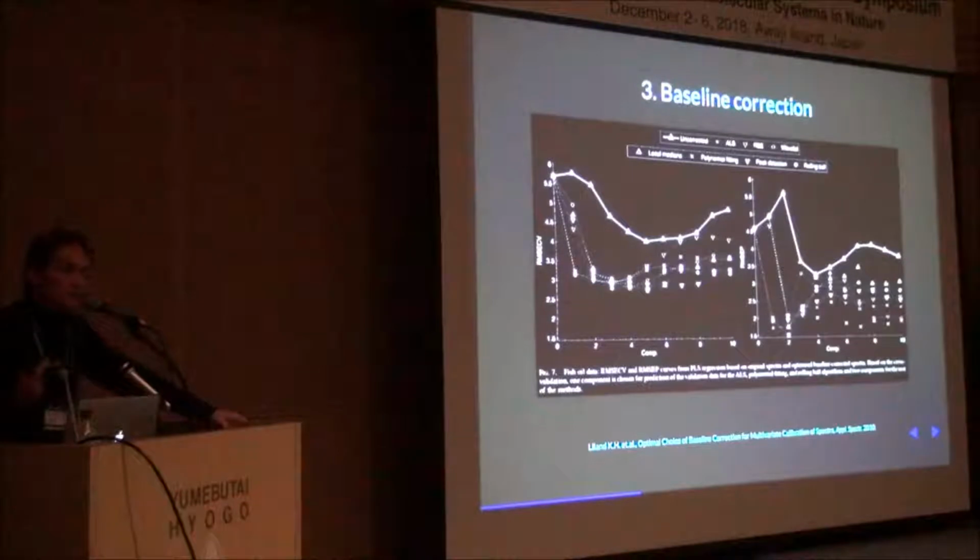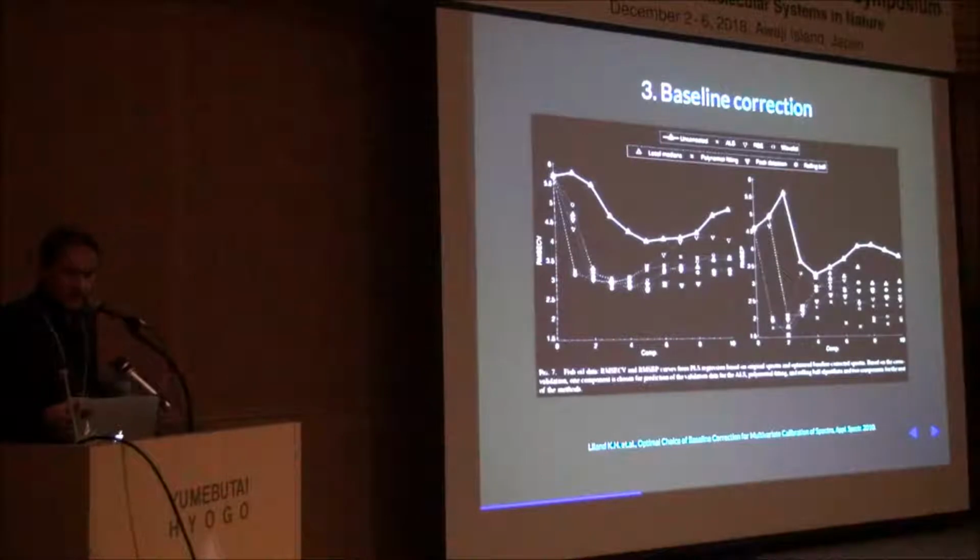You take the one that suits you the most, that's easiest to manipulate, to tweak to your need. And here is the same thing for prediction accuracy. And of course, we see here the region of overfitting.